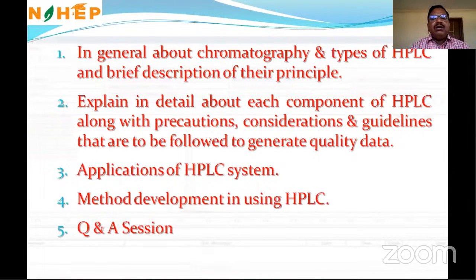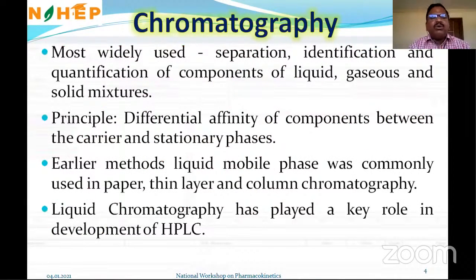And next I will explain in detail each component of HPLC along with the precautions, considerations and guidelines that are to be followed to generate quality data. And next the application of the HPLC system, and next method development using HPLC in analysis of various chemical components. And the last one is a question and answer session. First, chromatography.